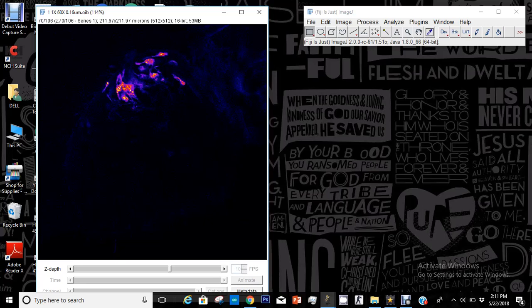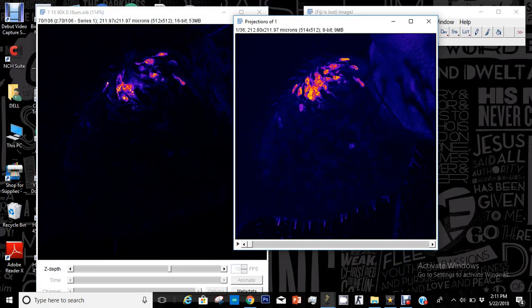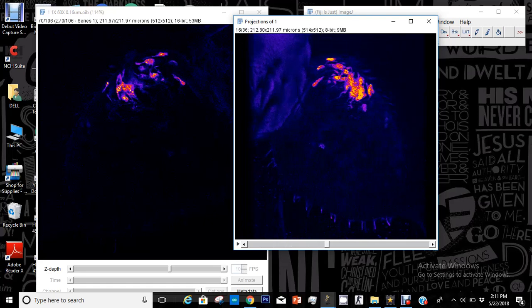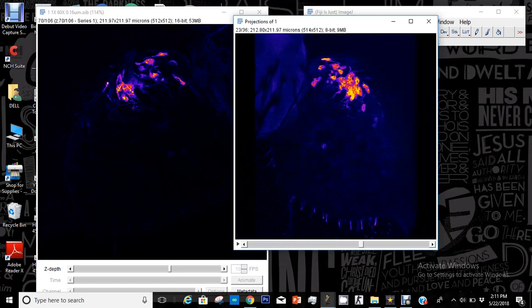But when you are imaging a whole mount or a tissue which has a thickness, then cells could be arranged in several planes, and taking a single plane won't help. So that's why I would count the whole stack. See, in this 3D projection, the cells are actually distributed in several planes, so taking a stack and counting throughout the stack could be a good strategy.